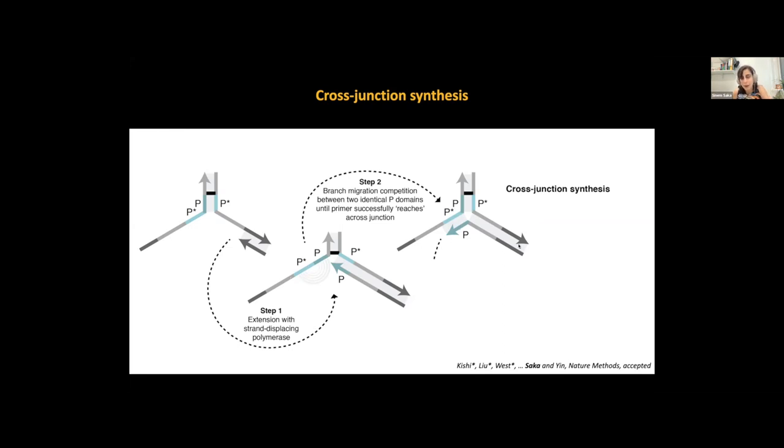And in this way, we can essentially now take the transcriptomic information from one side and connect it into one strand with the spatial barcode that we brought in. And so this creates the whole template in an enzymatic fashion after the spatial barcode incorporation. So I hope that was clear, but this is how we create the template for the sequencing afterwards.